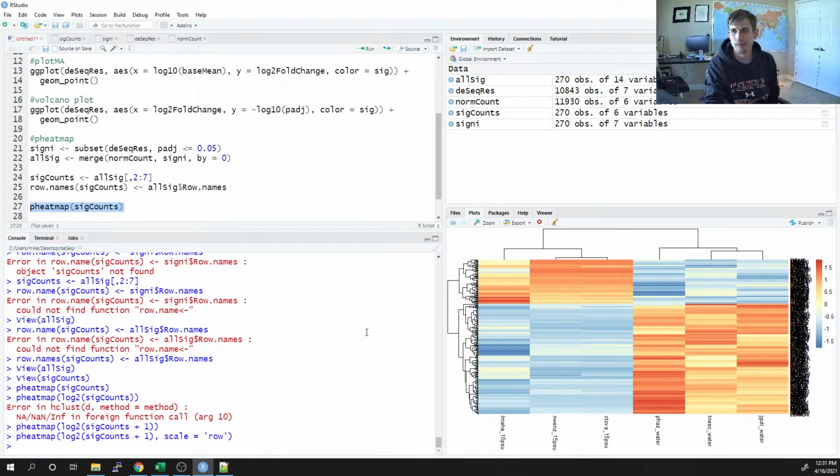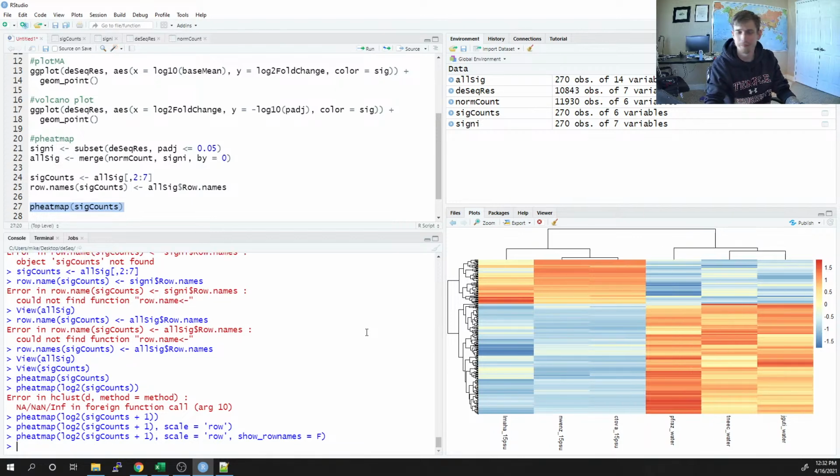All right. So again, I like heat maps because they let us see how the data changes. Right. It's transforming these numbers into a color, and the colors are a lot easier to see. But there's additional garbage in here, like the row names aren't very helpful. But pheatmap lets us manipulate that. I think we can set show_rownames equal to false, and that'll get rid of row names. That makes it look a little bit nicer. And we can also get rid of these trees. So the dendrograms are pretty helpful, right? I mean, they demonstrate clustering, right?